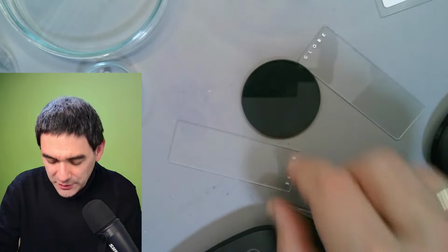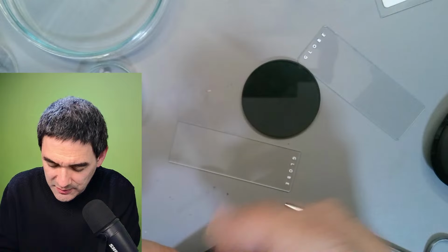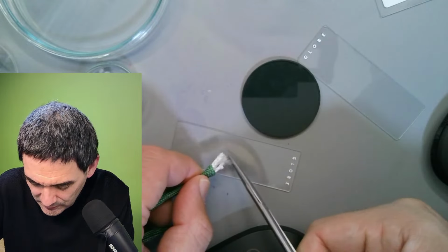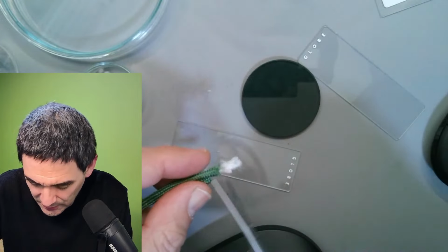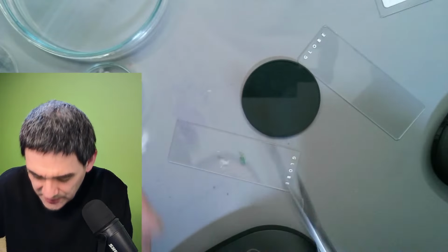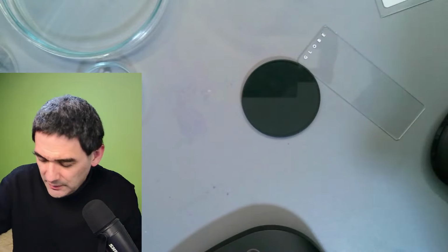We can maybe also take some of the pigmented one. This is the one here, and let's take a little bit from the colored outside as well. Let's try this again.